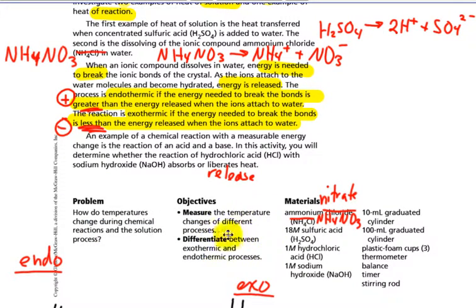Problem: how do you measure temperature changes during chemical reactions and solution processes? The objective here is to measure the temperature change of different processes, and then find the difference between exothermic and endothermic.